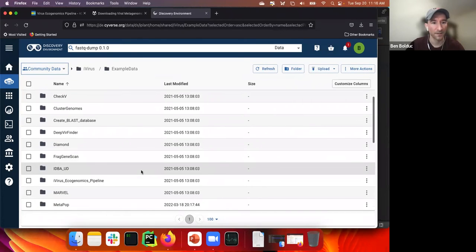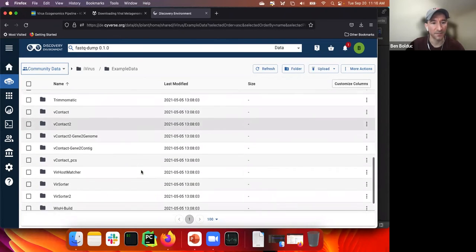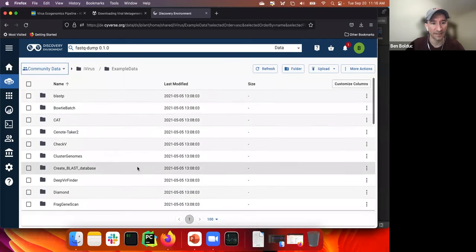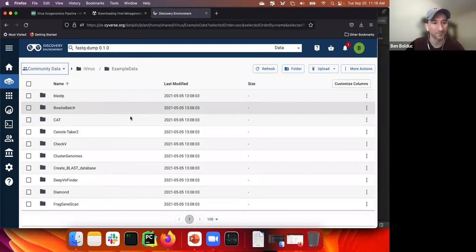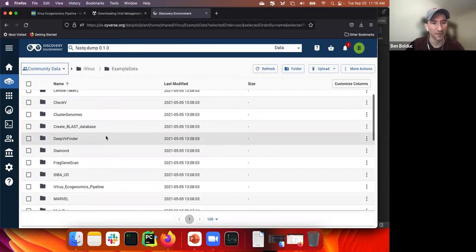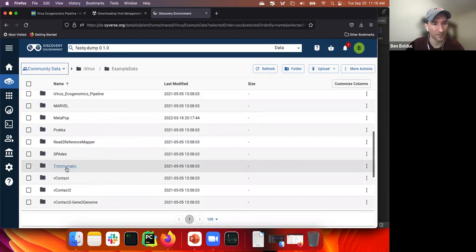Okay. So all of the apps, all of the tools that I'm using here actually have input data and the output from each one of those. And let's say, I don't think I've got FASTQ dump here. The reason we don't have FASTQ dump, let's actually look at Viromics.